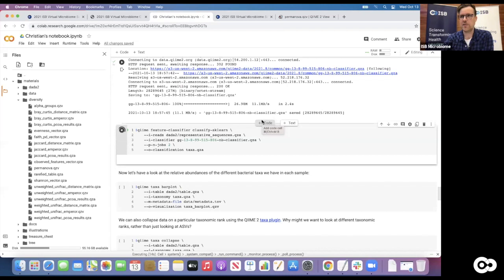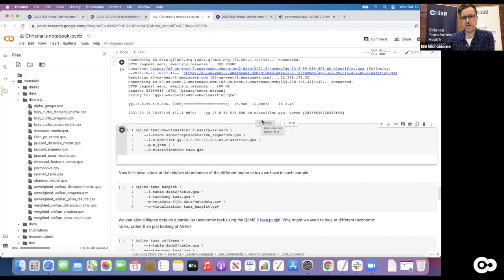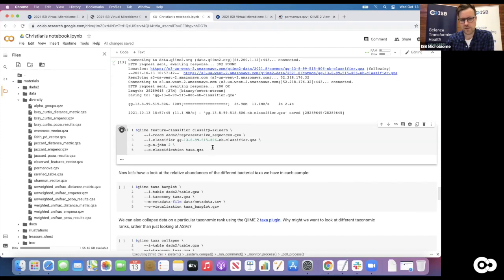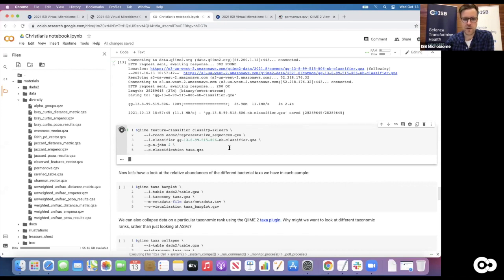That taxa QZA artifact will try to assign a taxonomic classification for each of our input sequences. If it can find one, it will. If the differences in probability are too small, it will tell you that too. It will go through all our representative sequences, blow them up into k-mers, count the k-mer frequencies, and use the naive Bayes together with the reference database to assign the probability that a particular sequence came from a particular taxon. It's always likely that if you have an organism never observed before - which happens way more often than you'd think, especially from environmental sources like cenotes or the ocean - it might be hard to assign a full taxonomy. You might get high-level classification at the phylum level but not down to genus level.